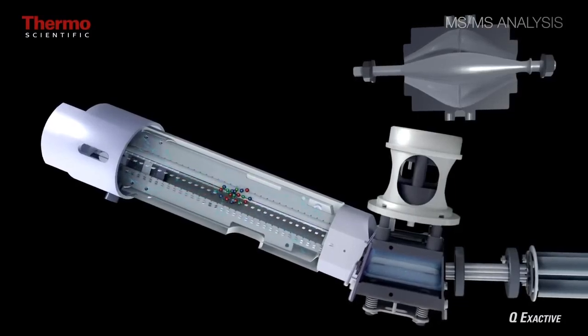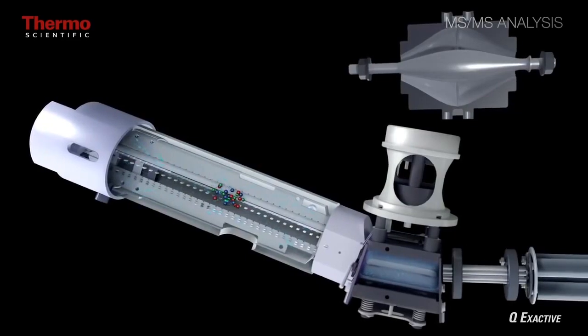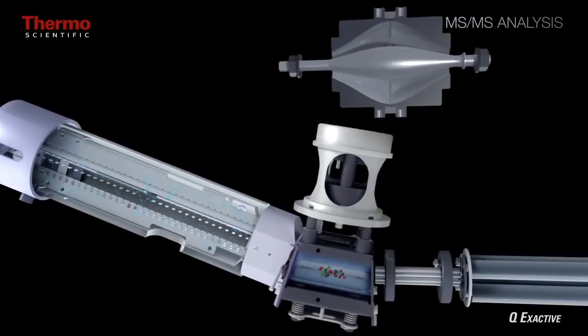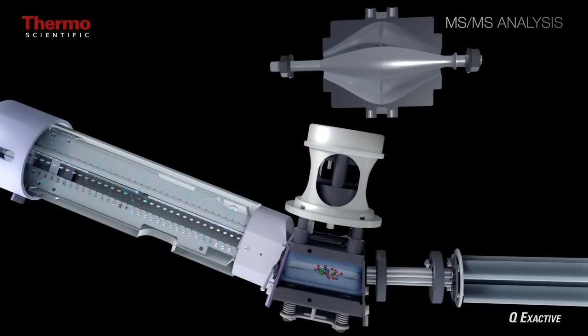Fragment ions are then collected into packets in the C-trap. They are stabilized and sent to the orbitrap for detection.